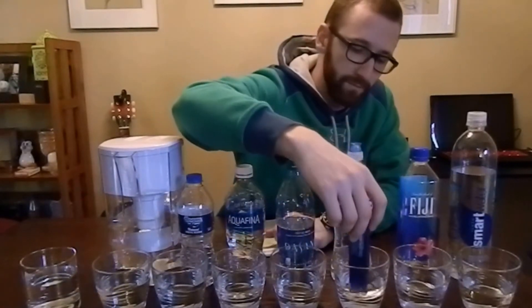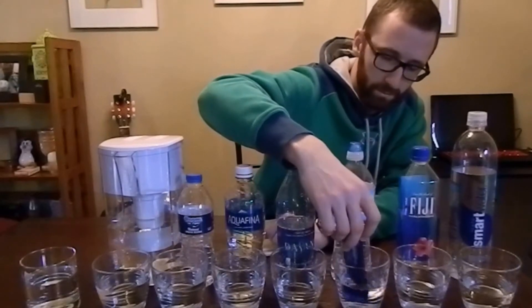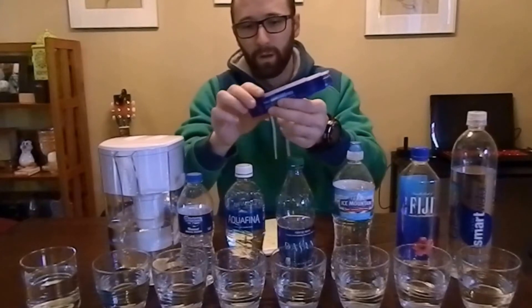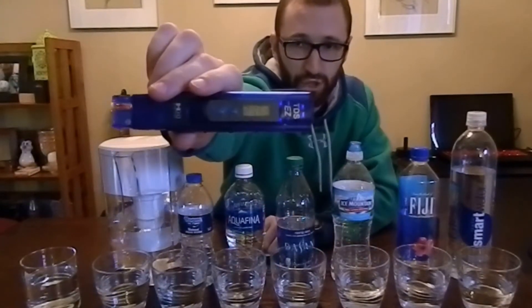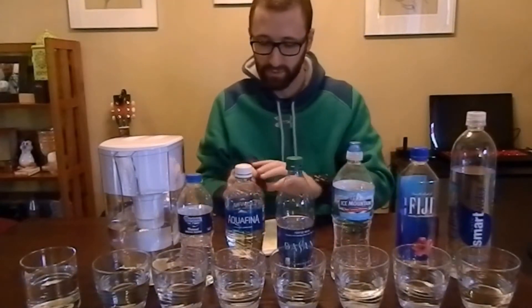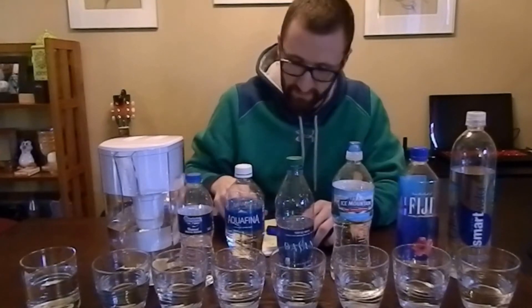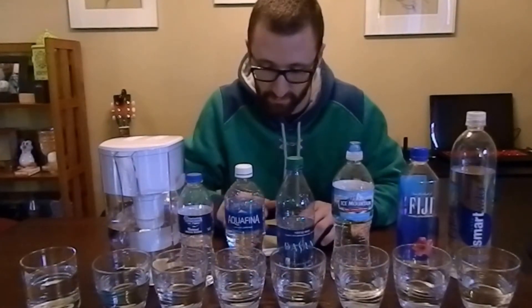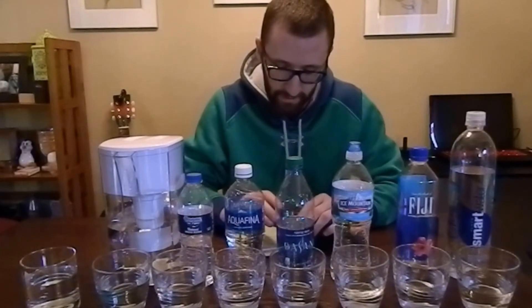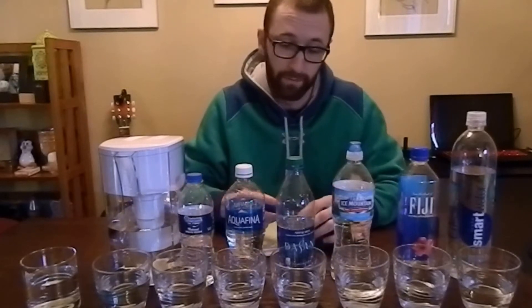Now for Ice Mountain. It comes in at 215 ppm. Definitely not anywhere near where we've been testing with the other ones, but it's definitely still drinkable water. There's nothing wrong with 215 — that's actually lower than the Brita pitcher.